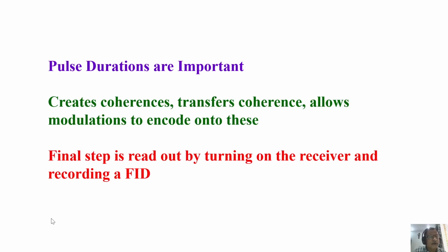In this class, I have told you more about two-dimensional NMR, continued from the last 2 classes, and I discussed the varieties of pulse sequences available, what pulse sequences are, what type of 2D information we can derive from the spectrum in a particular type of 2D experiment, how you choose the 2D experiment for you, what should be the size of the molecule for a particular 2D or 3D experiment, and how much utility is there. Everything we have discussed today. We'll come back in the next class and discuss more about these things, and literally we will start analyzing a couple of 2D spectra so that we get more familiarity.